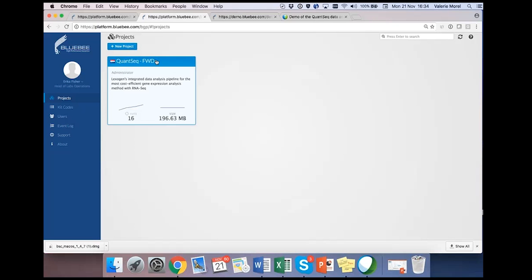So we also control for this poly A read-through. And of course, you can use other software like Cutadapt, TrimGalore. Even the old FastX toolkit trimmers can work with it. But in terms of speed, BBDuk from the BBMap suite is most suitable here. And the quality parameter for HTSeq count, as far as I remember, we used a minimum mapping quality of 10.